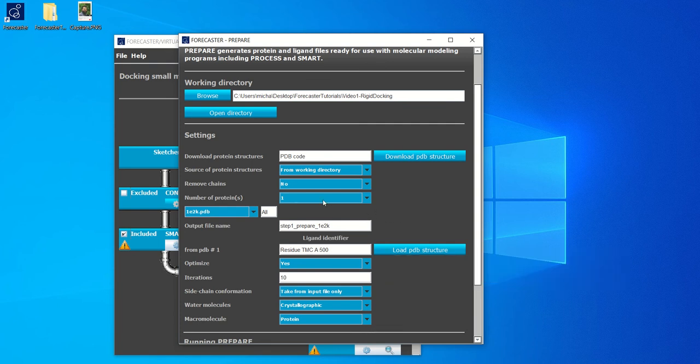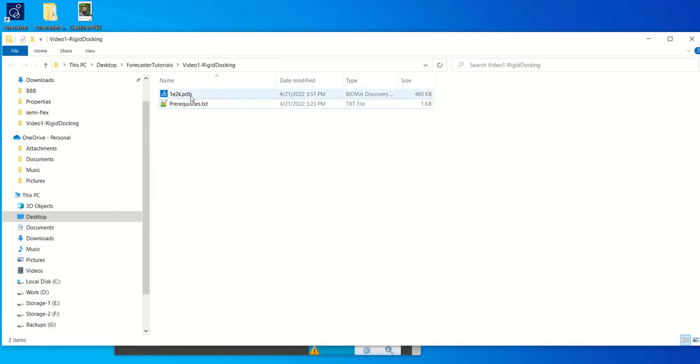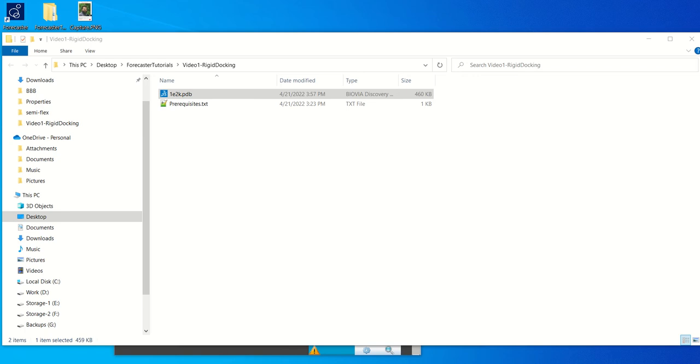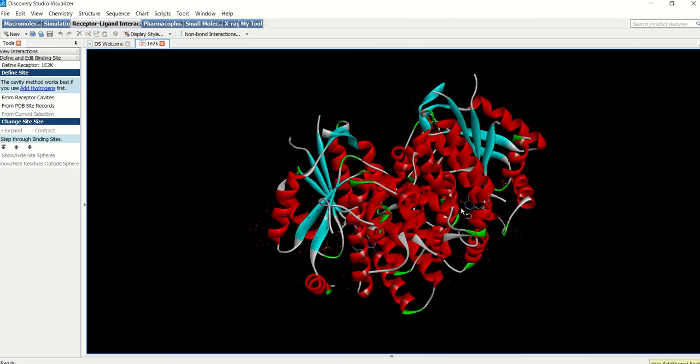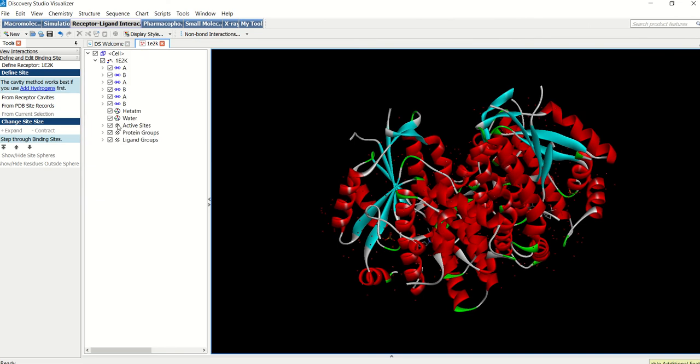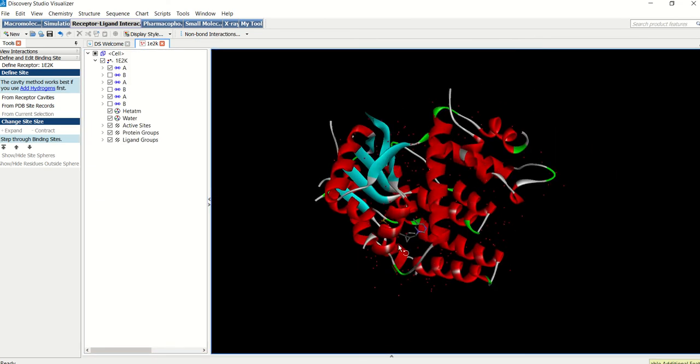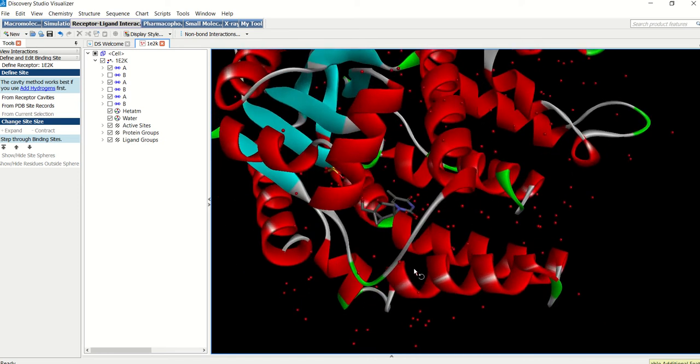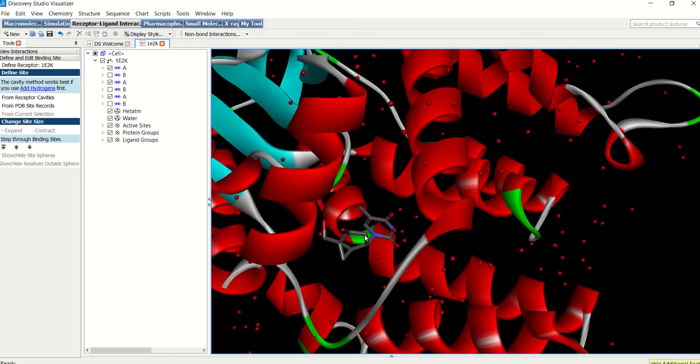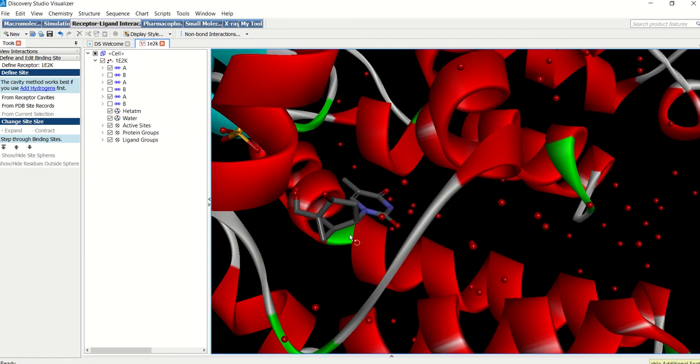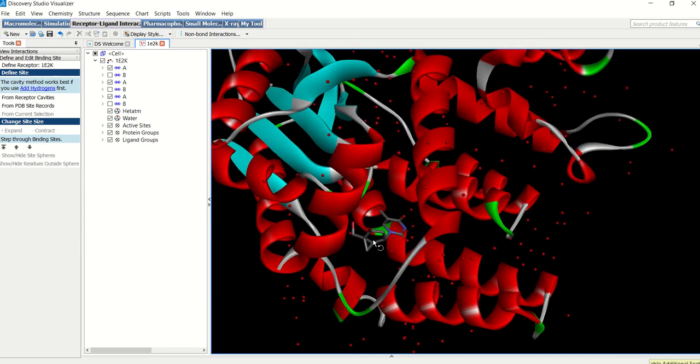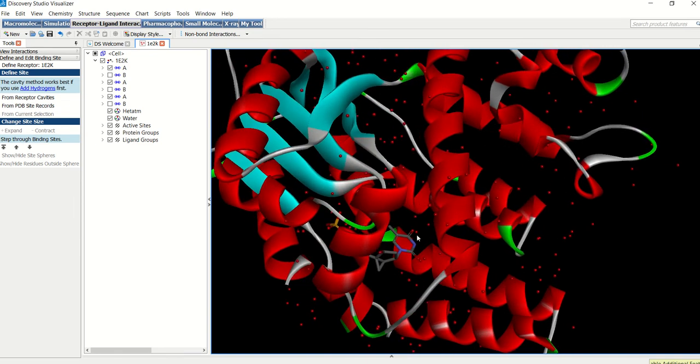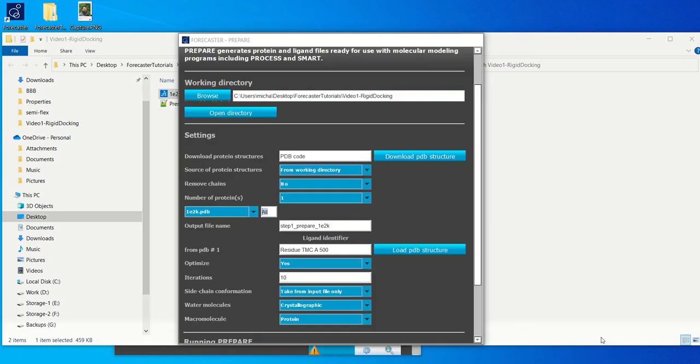We'll only need one protein, 1e2k. The all here represents the different chains. So if a protein has different chains like 1e2k, 1e2k has two different chains, A and B. And I will show you by opening the structure in a visualizer. So you can see here there are two different chains, A and B. We can hide one of them since we only need one for our docking purpose. And then we can identify the ligand, which is this one, TMC500. So that we have a good idea of what ligand we're trying to dock to our protein structure. Okay, so now that we have this, we can choose just chain A.